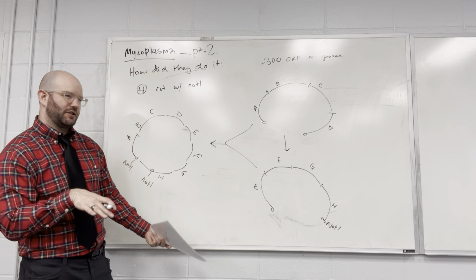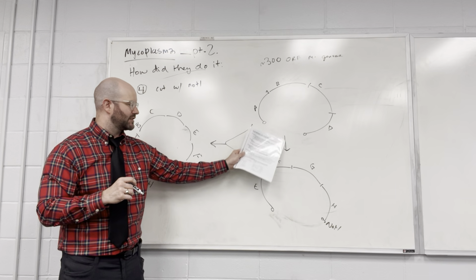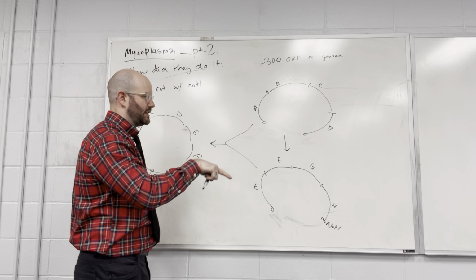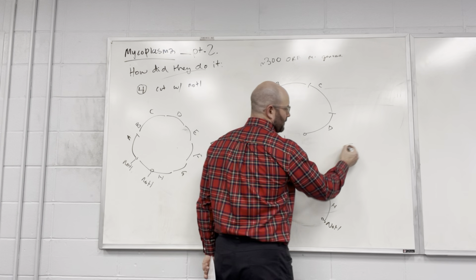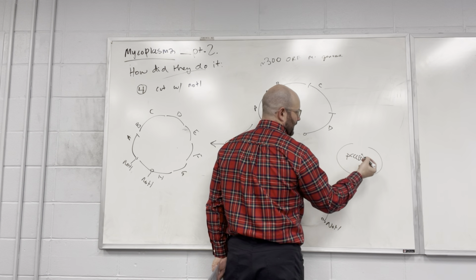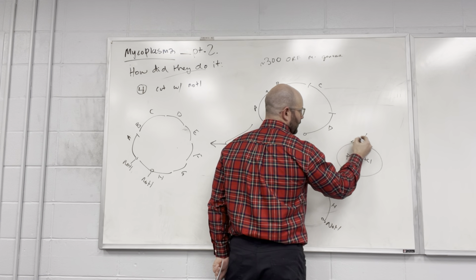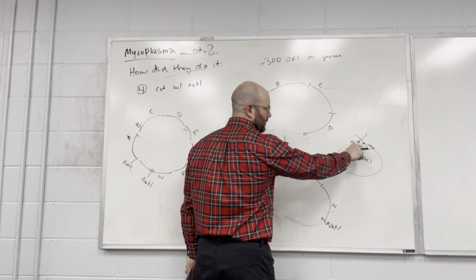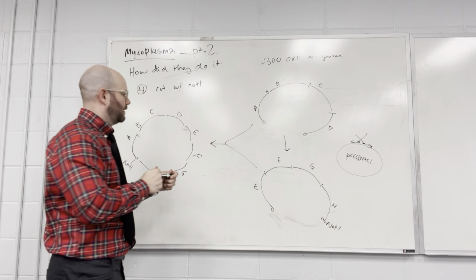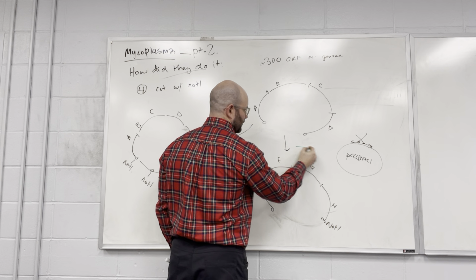They don't actually ever use a ligation, I don't think. But what's missing now? So you've digested, and they essentially repeat that PCR process. They have that PCR product, whatever it was, something like that. They repeat that process with these special primers. They PCR this. Let's make that product green.